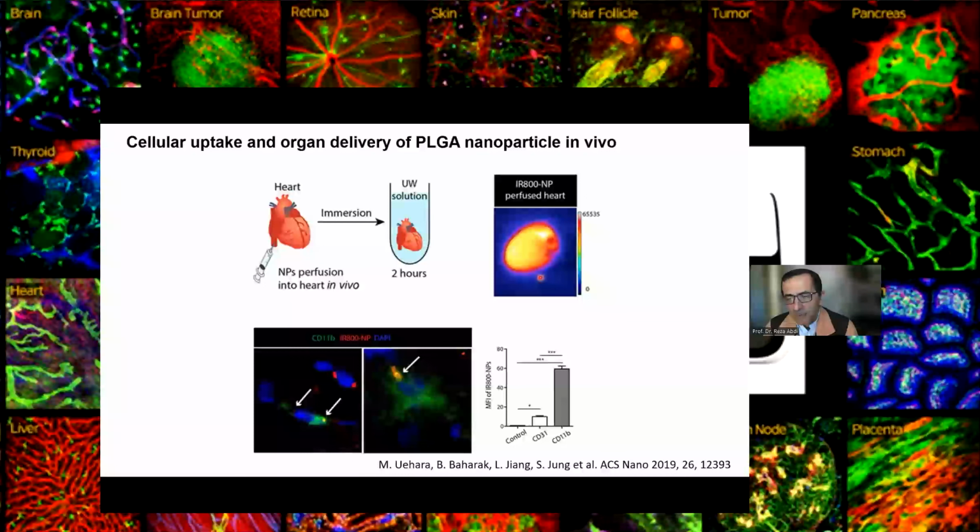Even people who are interested in cardiology might be interested in various forms of cardiac models where your imaging would be crucial. So one of the things that I'd like to develop is to be able to image heart and kidney transplant. I saw your kidney imaging, which was very cool. So kidney probably is easier. We do kidney in mice. So these two organs, I'd like to develop imaging around them with your technology.